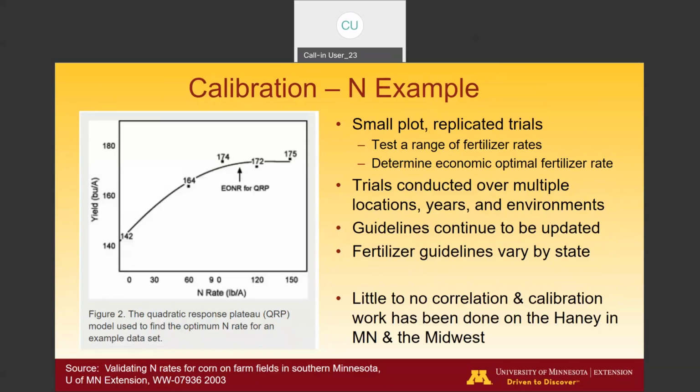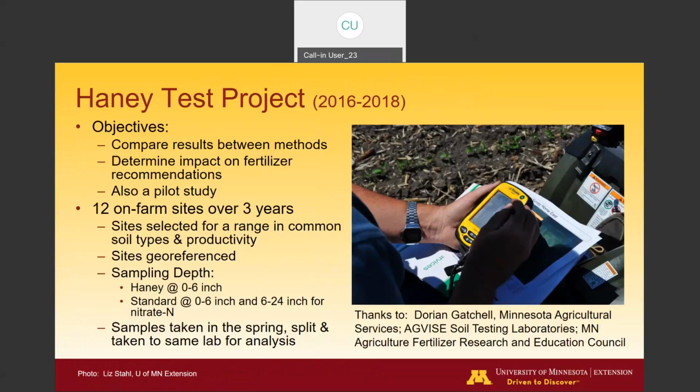But it is important to note that little to no correlation or calibration work has been done with the Haney test in Minnesota and really throughout the Midwest yet. So again, getting back to the Haney test project here, we started this back in 2016. We ran it for 3 years.